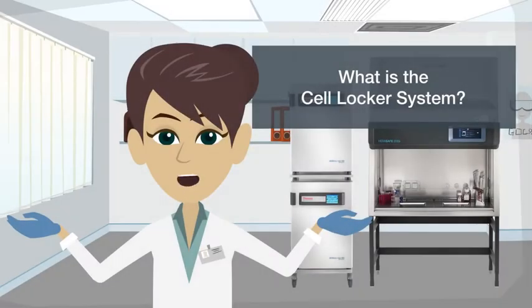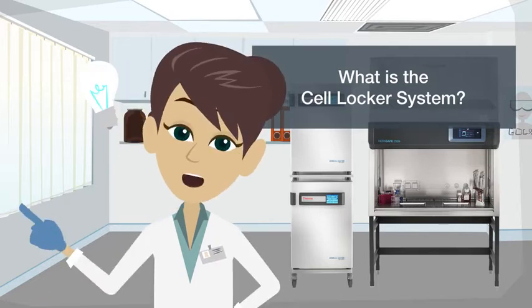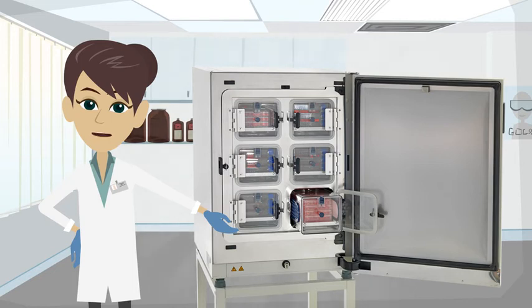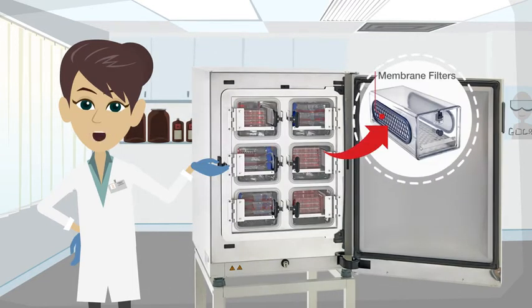What is the Cell Locker System? It is a breakthrough in cell culture management. The Cell Locker System consists of six individual polycarbonate chambers protected by membrane filters to segregate cultures.